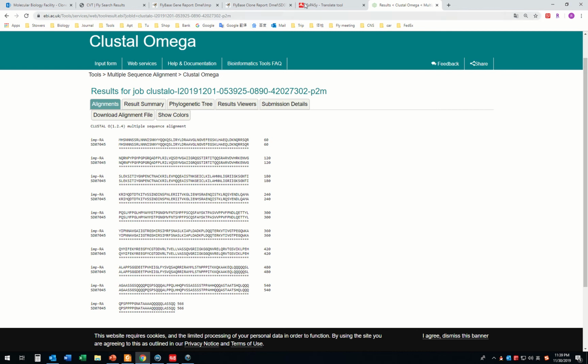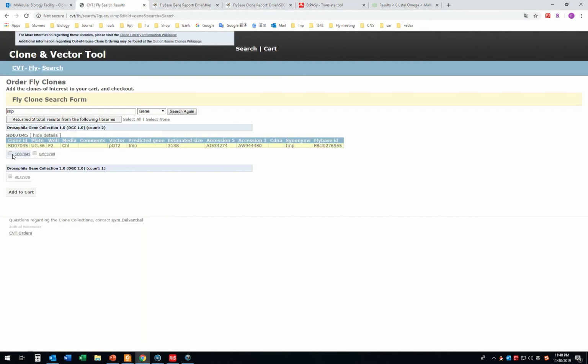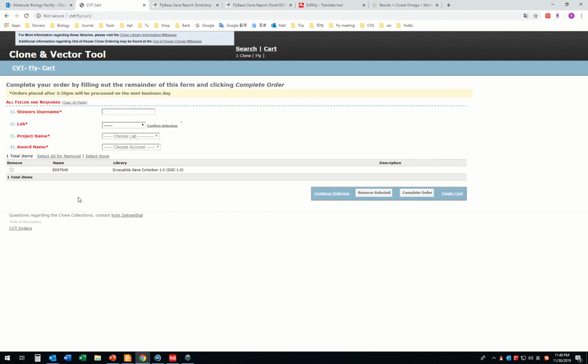So it's very good. We can order this clone SD and add to cart, and you can use your name as in lab. Okay, and you can continue ordering. Finally, after you order all of the clones, you can complete the order.